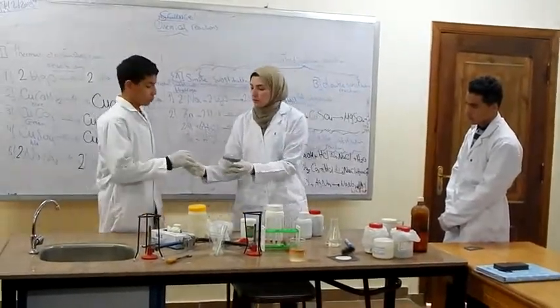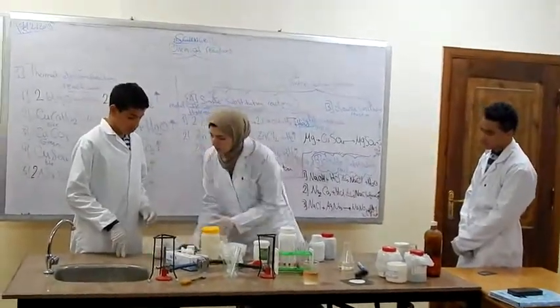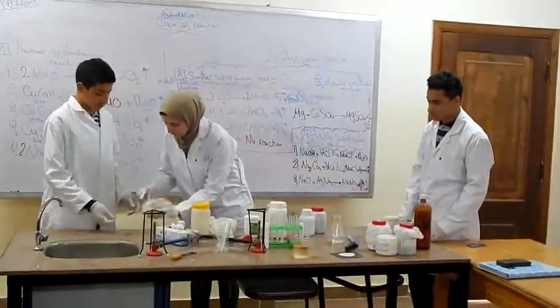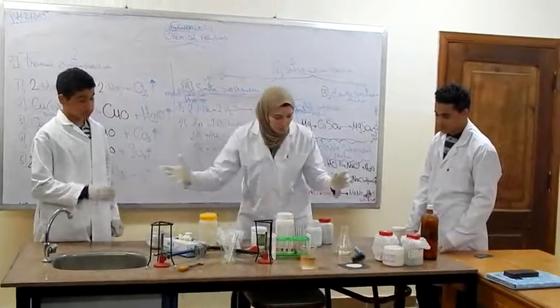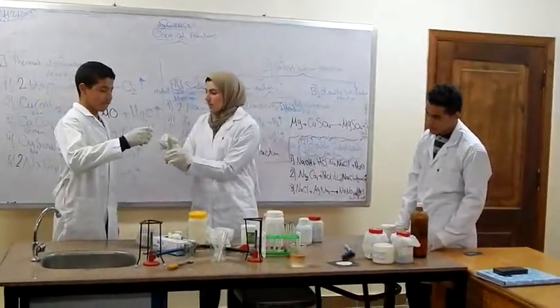Take some zinc. Zinc metal. Add hydrochloric acid.